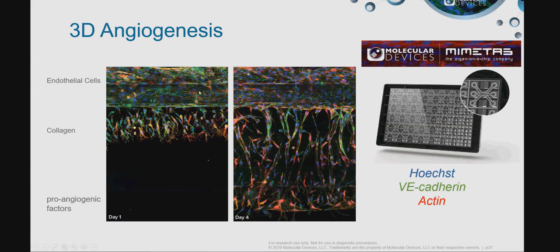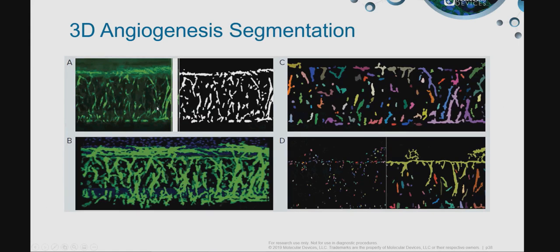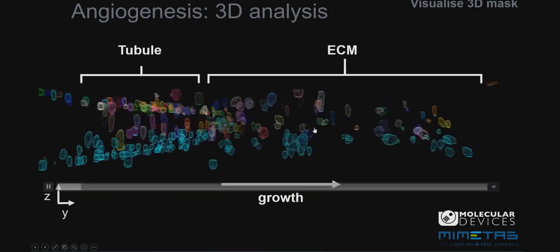Okay, so you're getting endothelial vessel formation here on the top. So this is all happening in 3D. So we're looking at the segmentation. What I want to share with you here is the tube formation, the sprouts going down towards those angiogenic factors, that we're able to segment and identify as a tubular structure. The color coding here represents the different tubes in the environment. Here you can see a nice rotation of that.